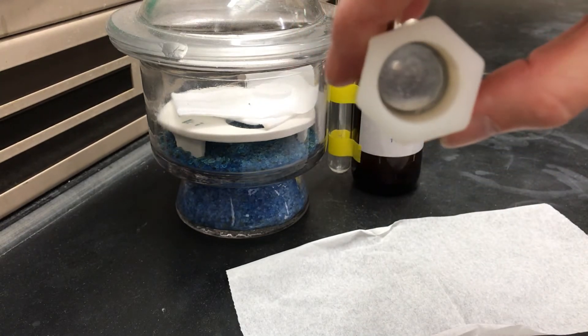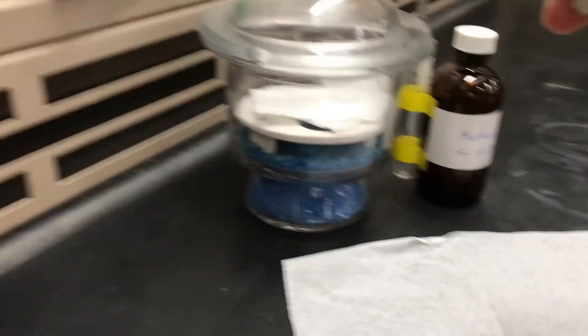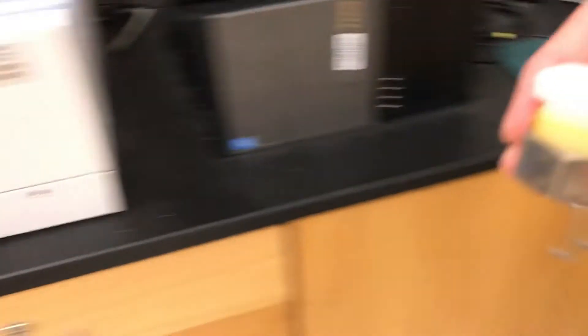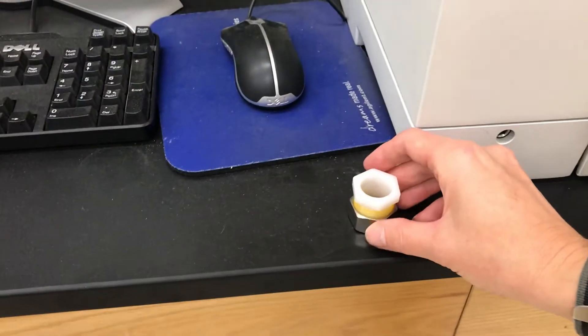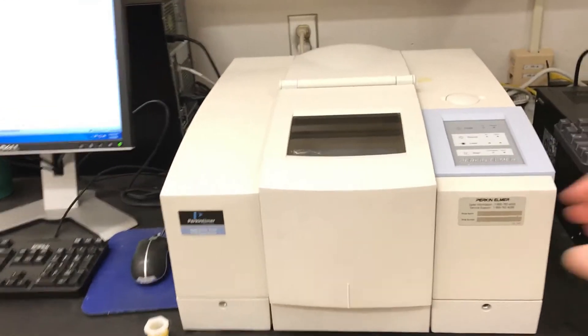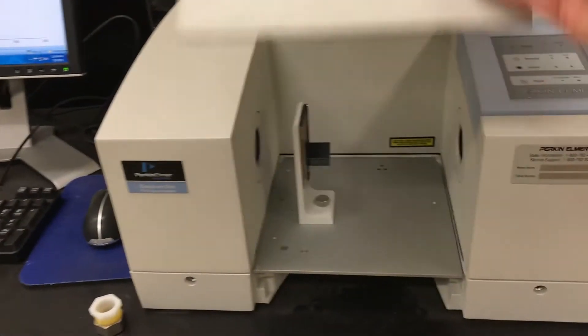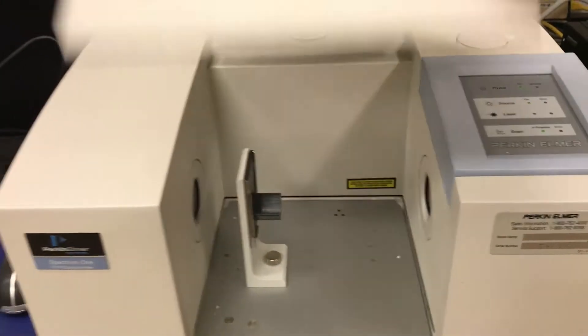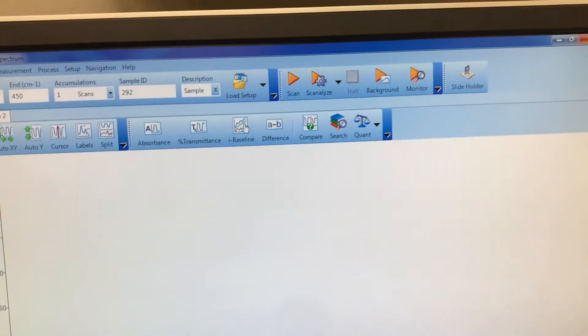So now I've got a thin layer of my sample between two salt plates. We'll bring that over to our instrument which is this white box and first we want to make sure that there's nothing inside the instrument, that it's empty, because the very first thing you do is over at the computer push on the background button.